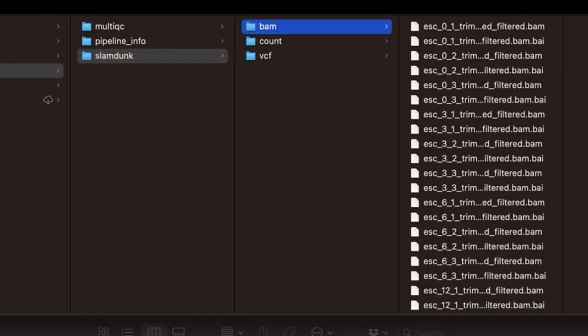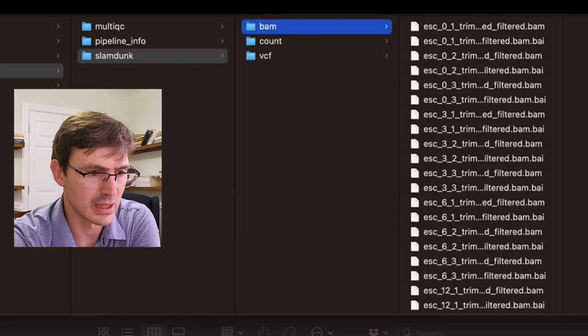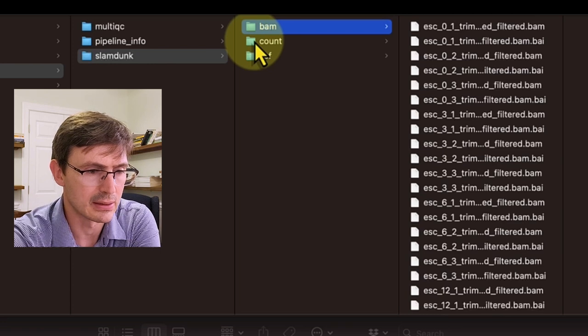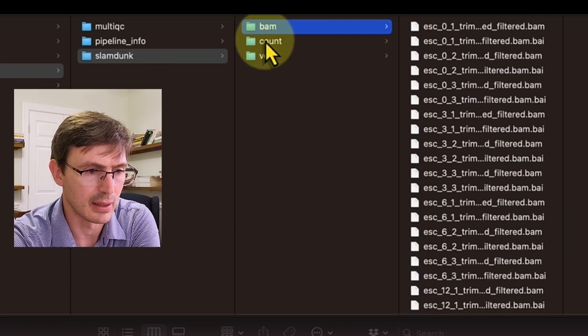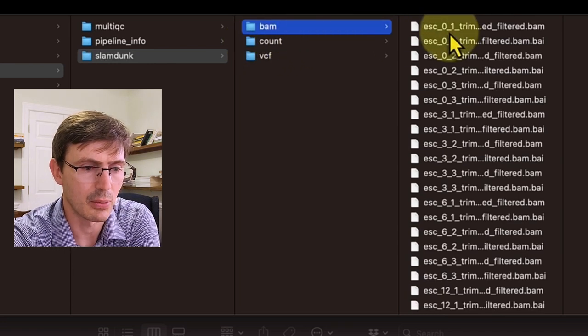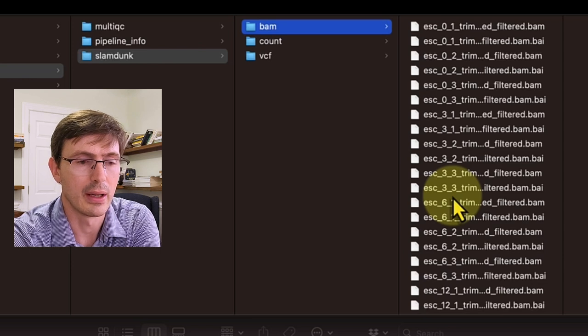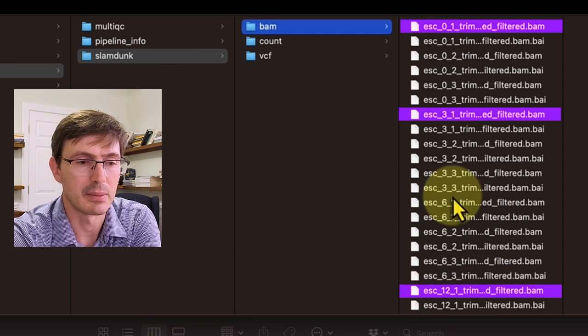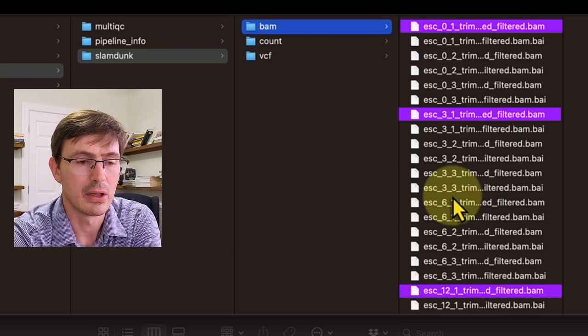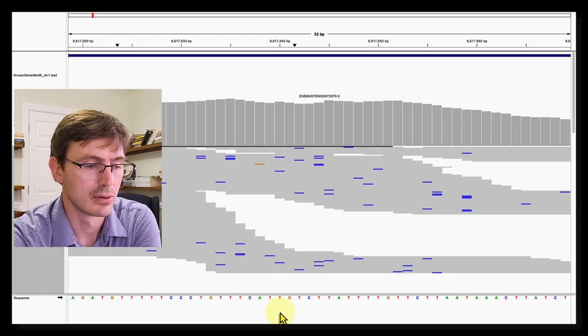So when you run your analysis at a certain point, you align the reads to generate BAM files. In our case, we are using SLAMDUNK and the files are in this BAM folder. And here we have four different time points. So now I will open a file for time 0, 3 and 12 to see how the raw reads map to the genome.